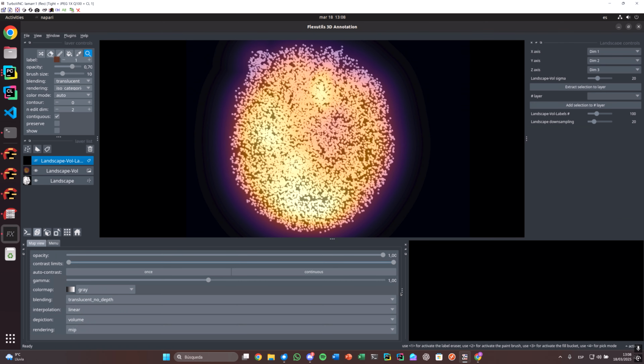Once the window is open, you will be seeing this Napari-based viewer showing different panels and also the conformational landscape that we have just obtained using the dim red protocol. Before analyzing the landscape, let's see what are the different panels that we have in this viewer. The first panel is the main top window here, which comprises the window where you have the conformational landscape and also some visualization options for this conformational space.